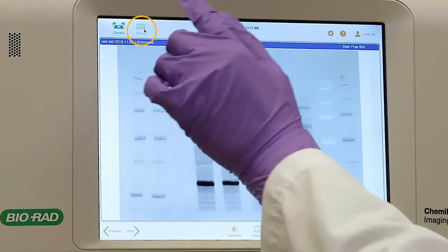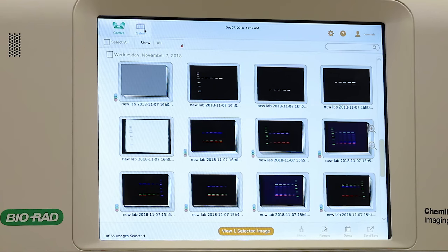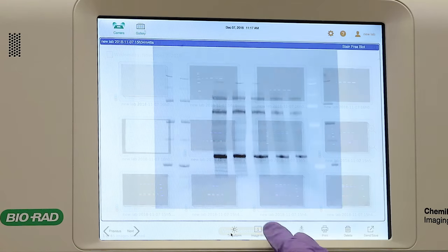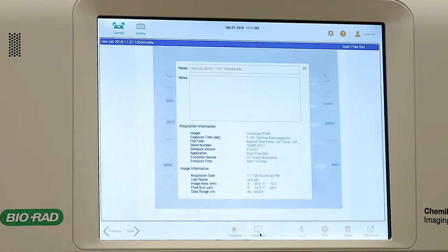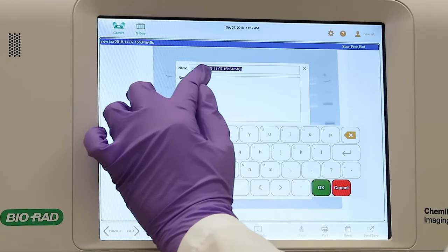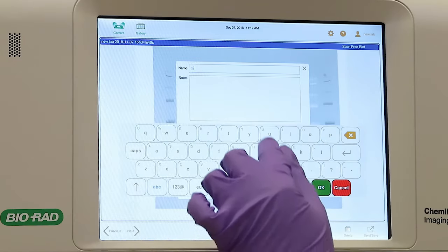Your images will be automatically saved and exported to the gallery. Tap the image info icon. Here, you can enter a custom name and any notes you'd like to include about your image or experiment.